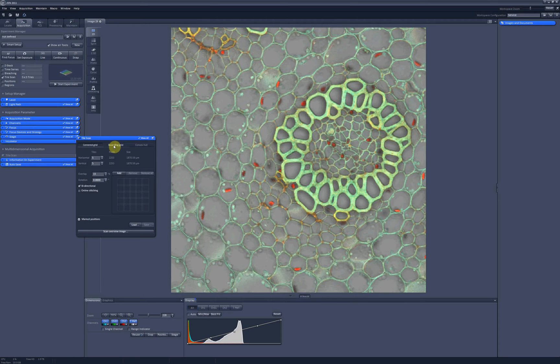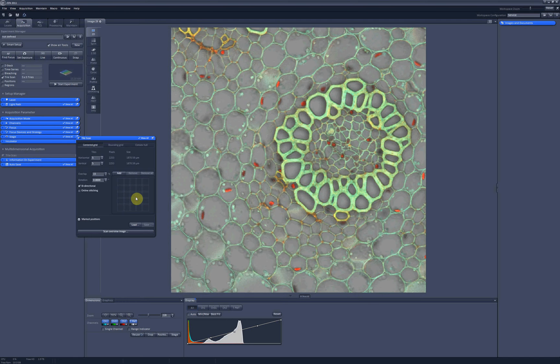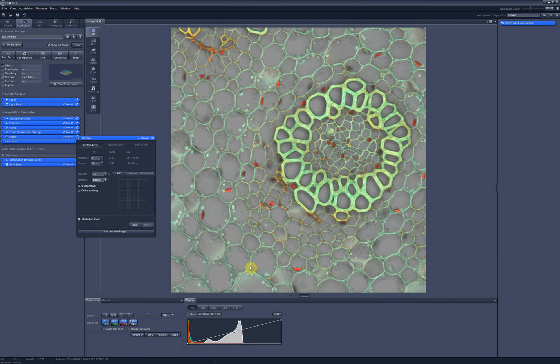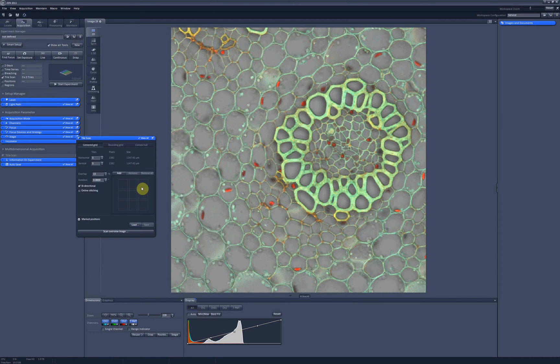And you can see that there are three ways you can perform the TileScan. In the center grid option, your current position is going to be used as a center tile, and then the total number of tiles are defined by the numbers you type in here. So in this case I'm going to have this position as a center tile, and then there will be three on three TileScan.